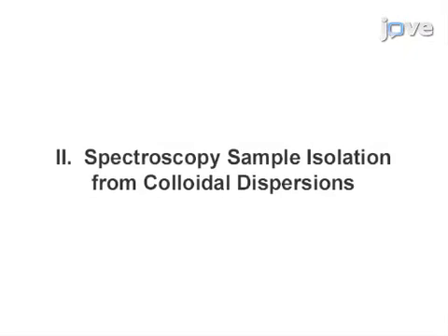This technique can help answer key questions in the field of colloid and surface science, including how functional particles are stabilized in colloidal dispersion. In this video, I'll demonstrate the procedure associated with infrared spectroscopy sample preparation and measurement.